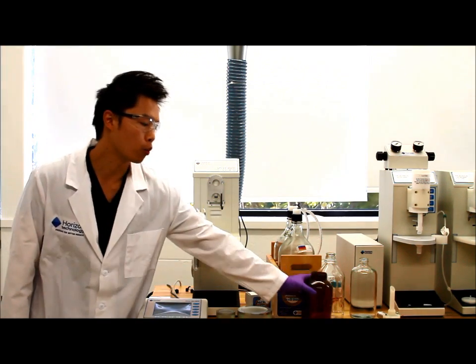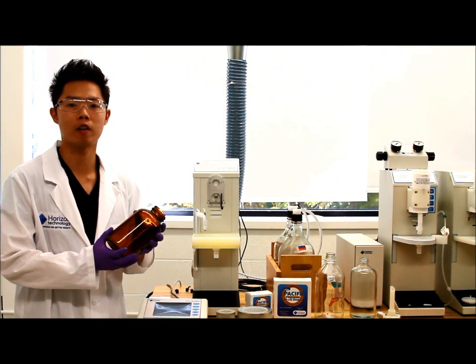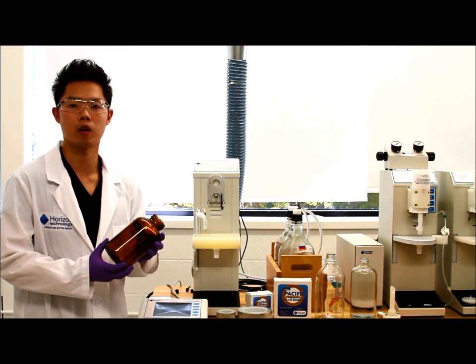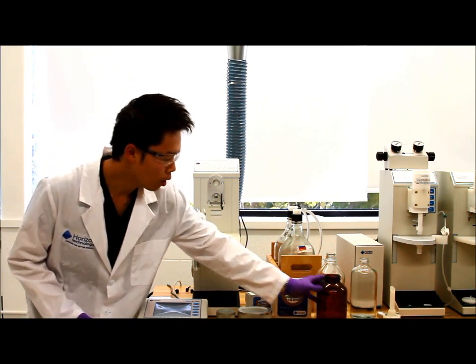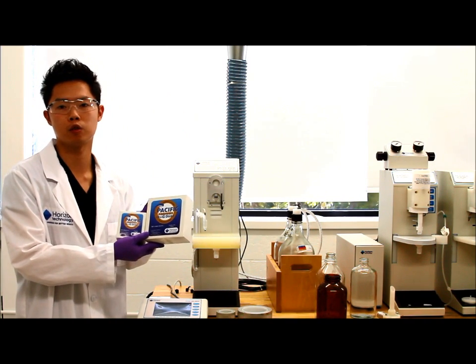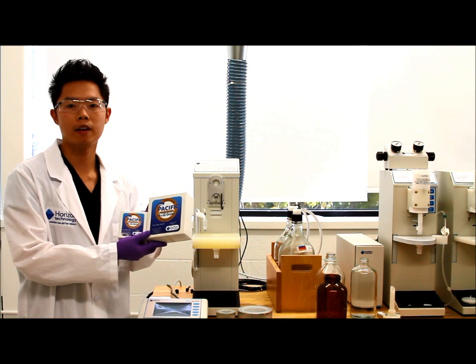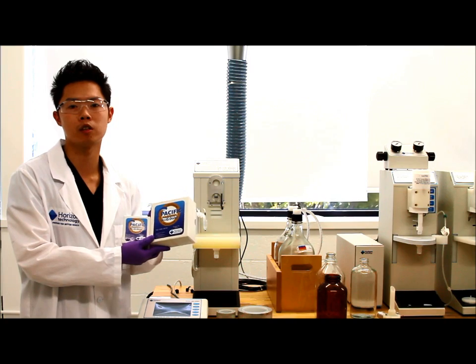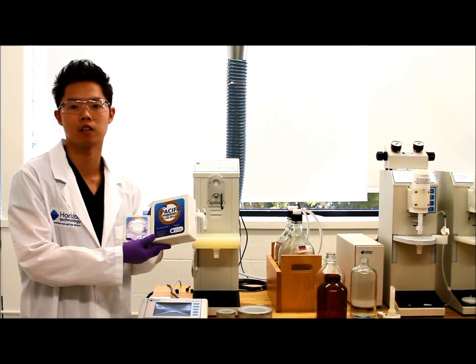The best aspects of this machine is that it can use the original sample bottle that you may have. We have specifically designed cap adapters to accommodate your sample bottle. We also have specifically designed SPE discs to extract all N-hexane extractable materials as well as hexane extractable materials that are not absorbed by silica gel.